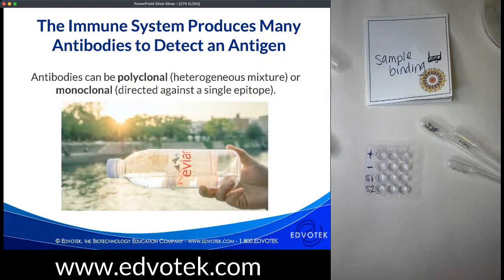So we can think about our antigen like a water bottle. The hand in this picture is holding the bottom corner of a water bottle. We can think of that hand as an antibody that can recognize one specific antigen, and that would be a monoclonal antibody. So we're only recognizing one surface of that bottle. However, if you took your other hand and held the cap of that water bottle simultaneously, we would be recognizing two sites on the water bottle, not just one. And so we could think of that as being like a polyclonal antibody, in that it recognizes two different locations of our antigen. Now, one type of antibody isn't necessarily better or worse than another.